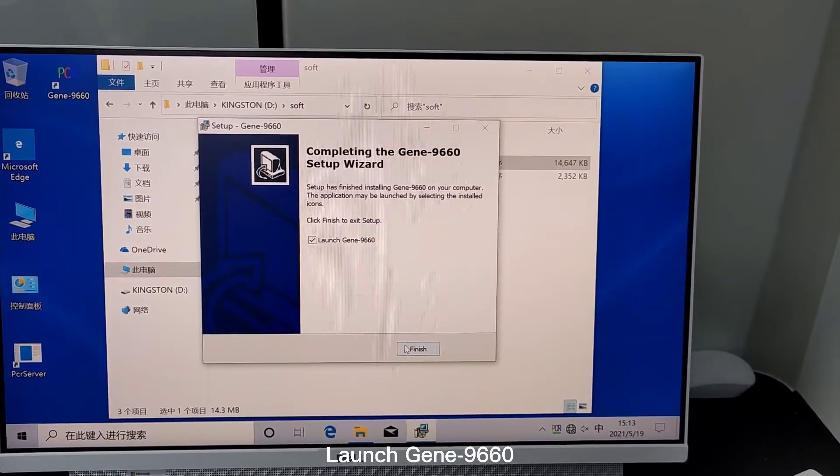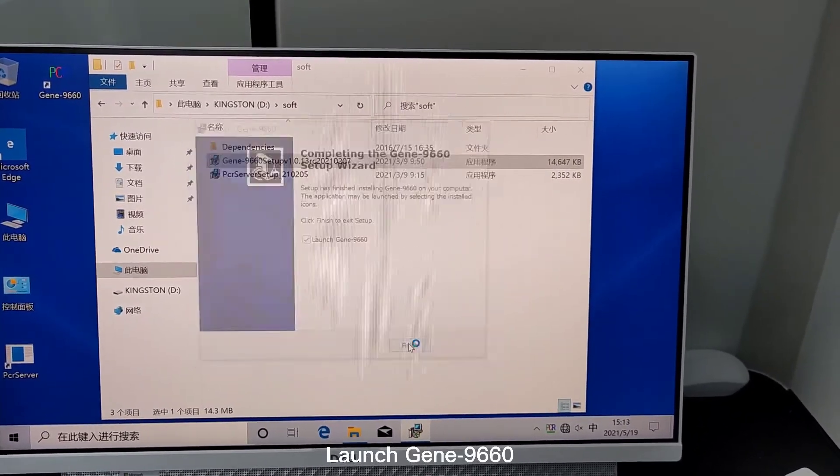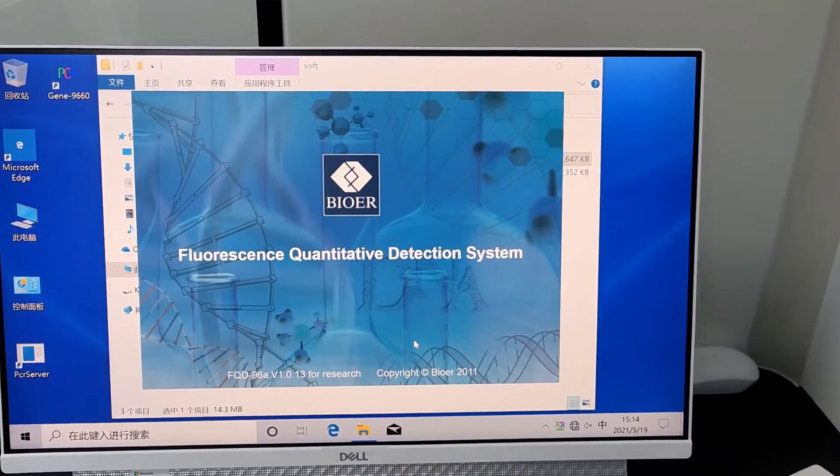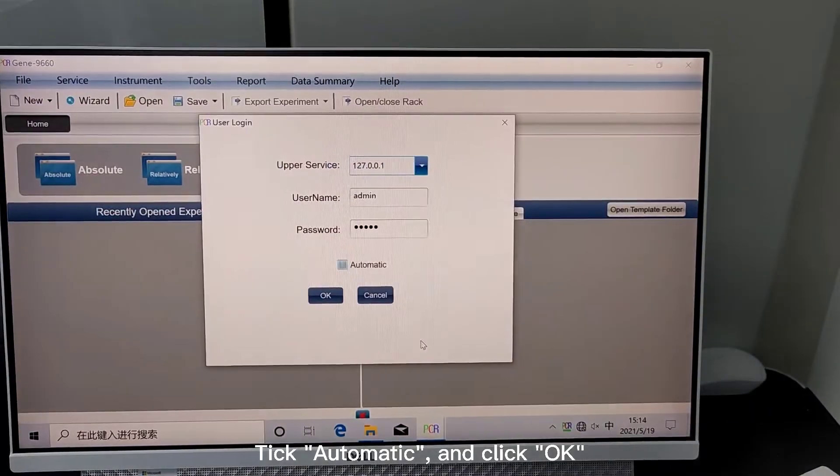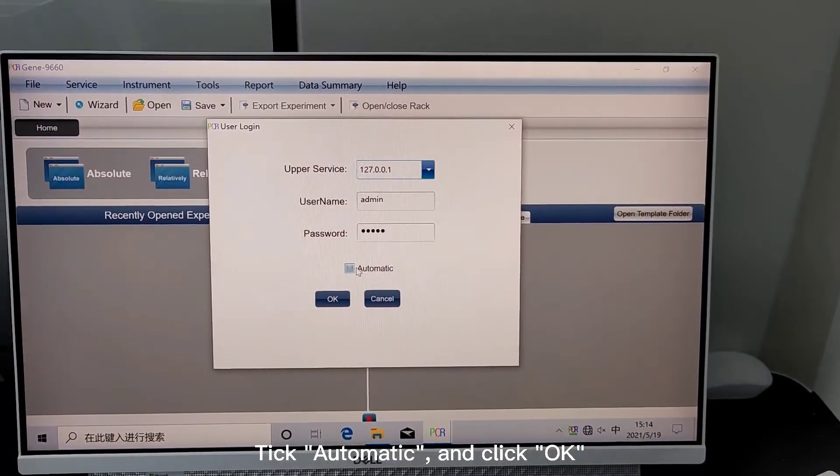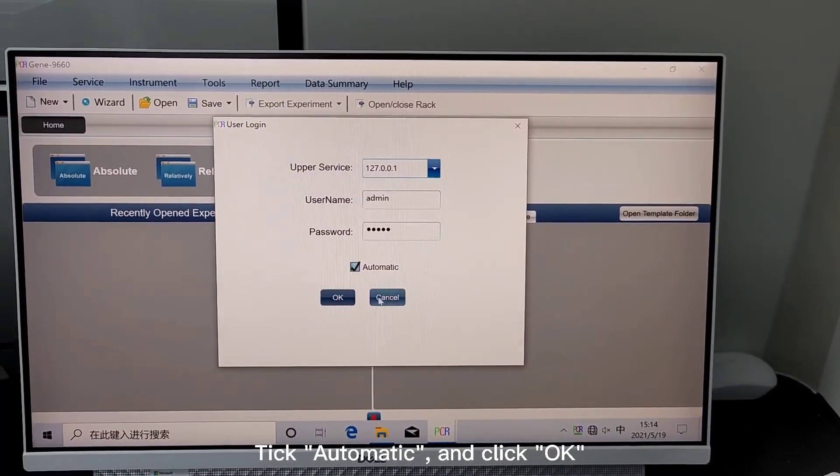Launch Gene-9660. Tick Automatic and click OK.